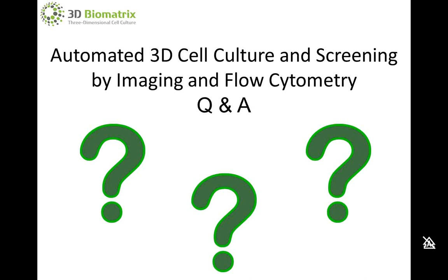The first one I'm going to address to you, Mike, and that is, there was a question whether you tried staining a spheroid and imaging it, then dissociating it and running it on the flow cytometer so that you had the same sample on two analysis platforms. We did do that. I didn't show that data, and that's a great question.